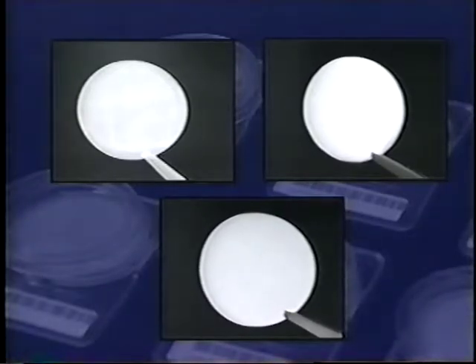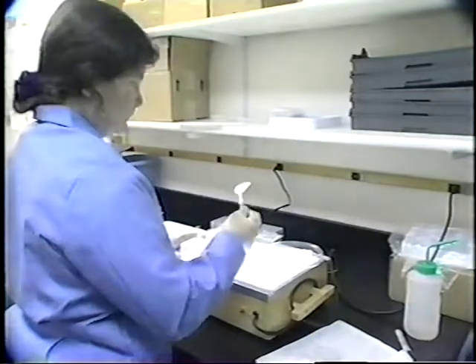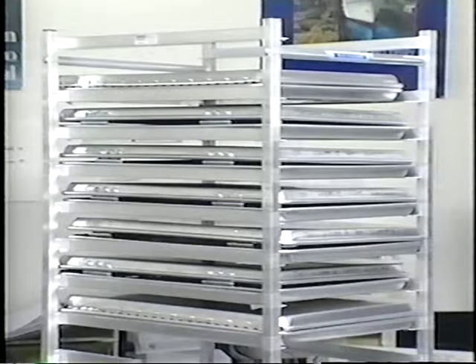The first type, Teflon membrane filters, tend to produce variable blank masses immediately after manufacture. As the time between manufacture and use increases, this variability decreases. Therefore, a 1-month storage period followed by a week of equilibration in the weighing environment is recommended. The temperature for equilibration must be within 2 degrees of 20 to 23 degrees Celsius, and the humidity within 5% of 30 to 40%.